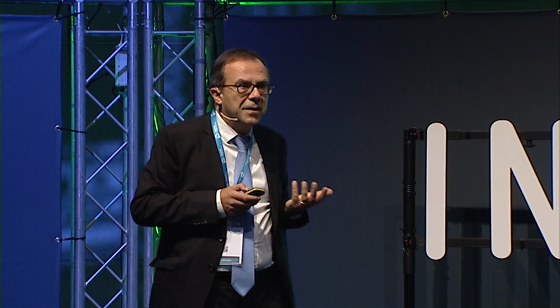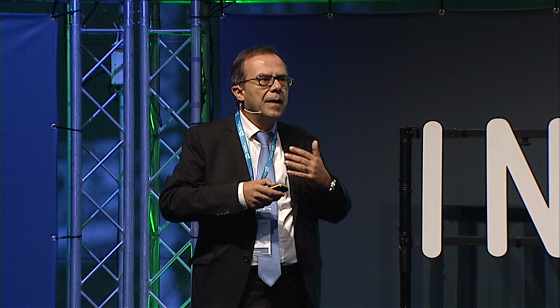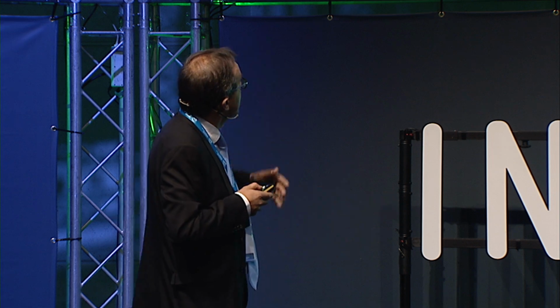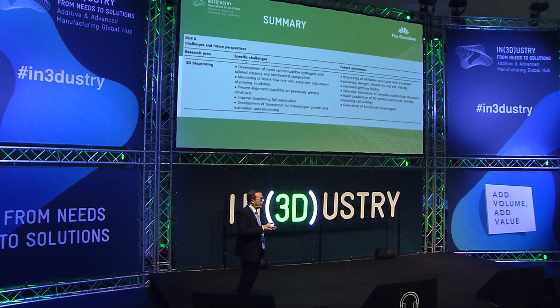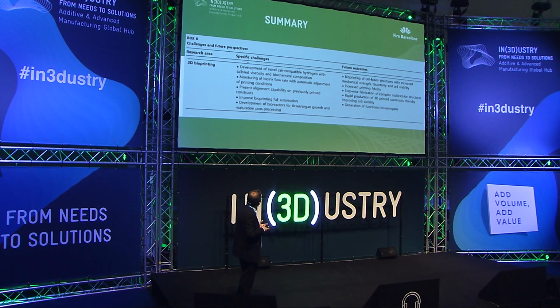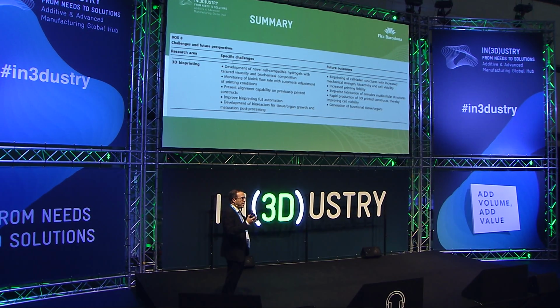So obviously there are many challenges to develop that, as has been explained before my talk. Obviously that will be the process at this moment in the lab, but probably in the next 10, 15 years that will be available in many of the hospitals worldwide. Some of the specific challenges that you need to address in each of the applications are the development of cell-compatible hydrogels with the right properties, viscosity, biochemical composition, the monitoring of the bioink flow rate, the alignment, and the automatization of the system. So there are biological problems together with the engineering process.